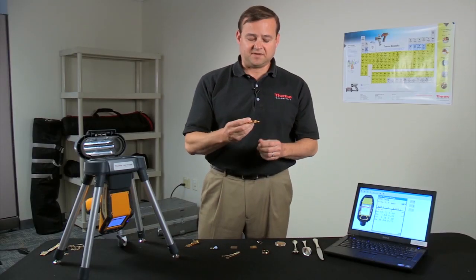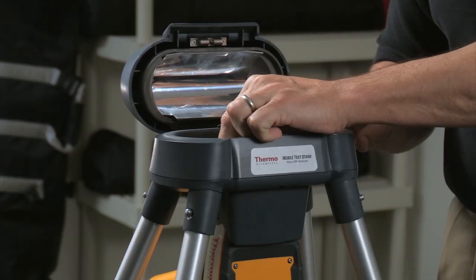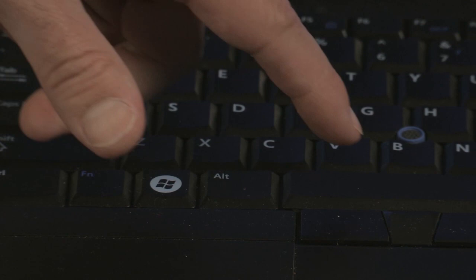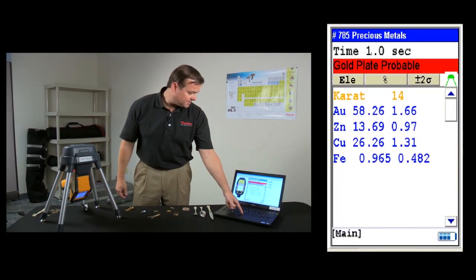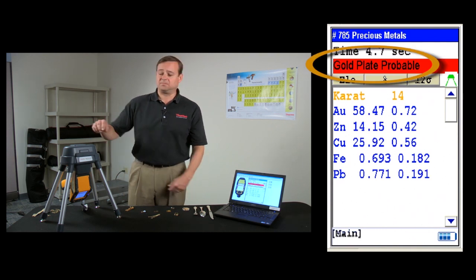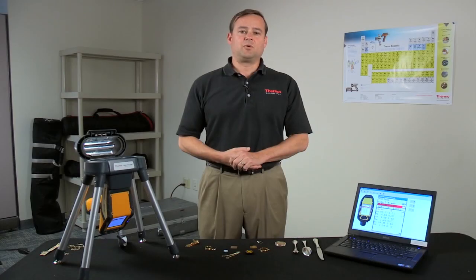In this case, a watch face — 14 karat gold by XRF reading, but the audit technology is in fact telling you that gold plate is probable.